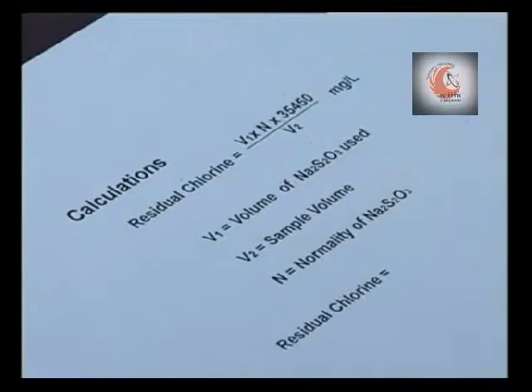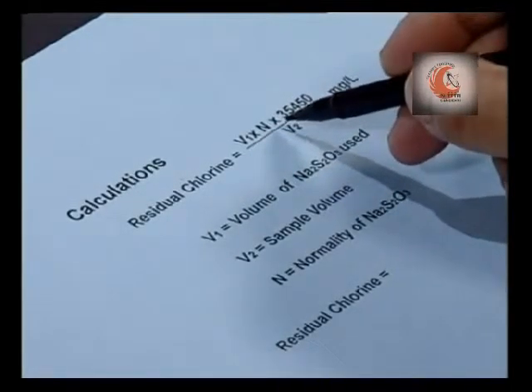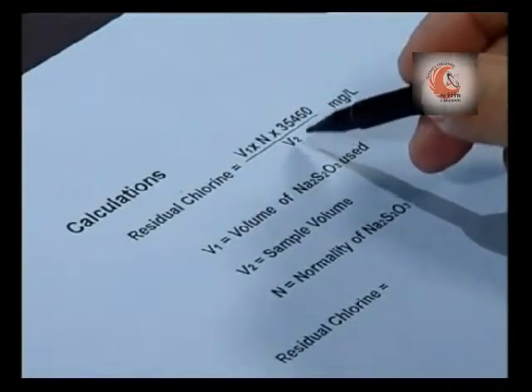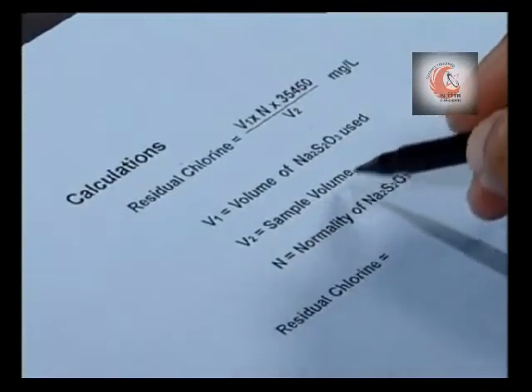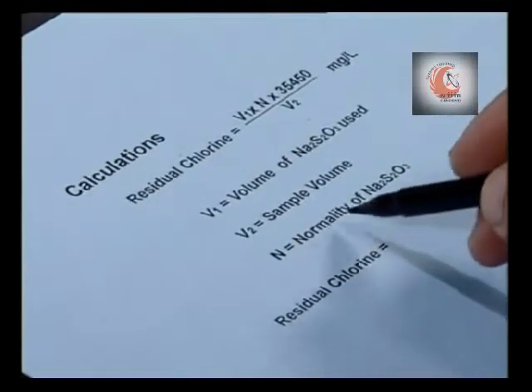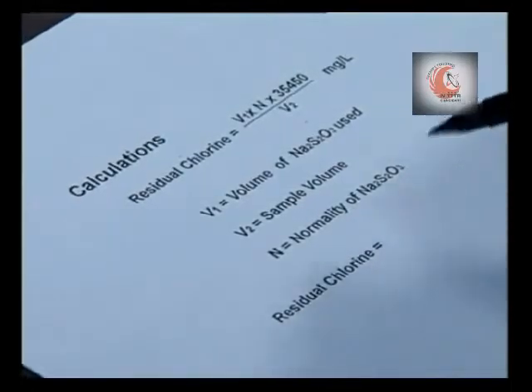The residual chlorine is determined by using the formula V1 into N into 35450 divided by V2, where V1 is volume of sodium thiosulfate used, V2 is sample volume, that is 200 ml for this case, and N being normality of sodium thiosulfate, which is 1 by 100.